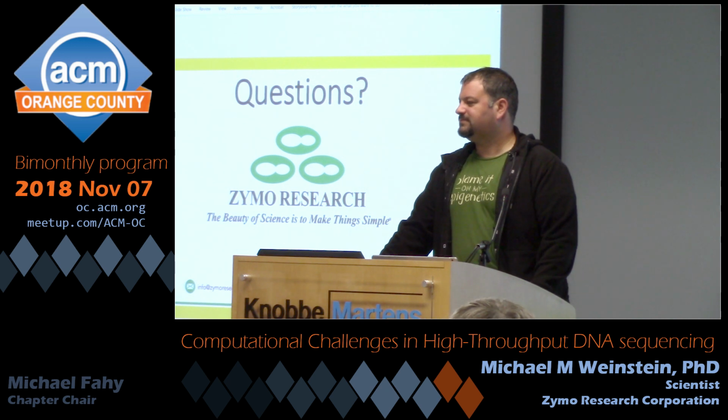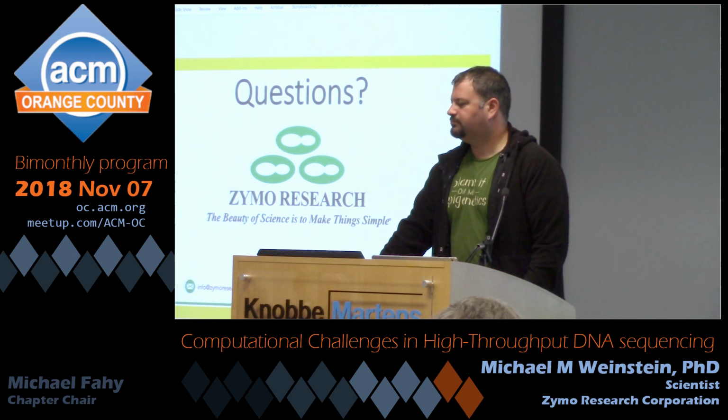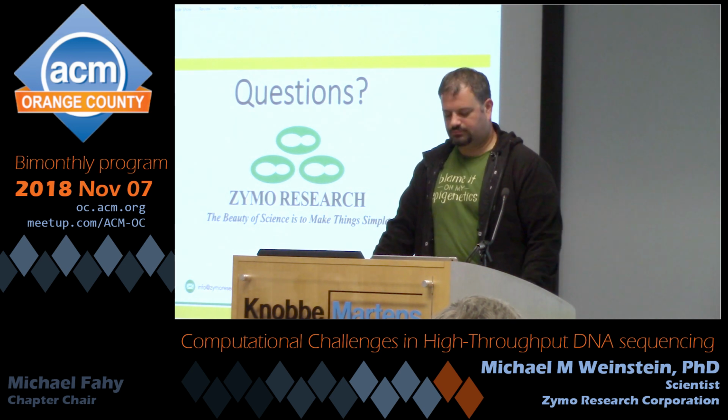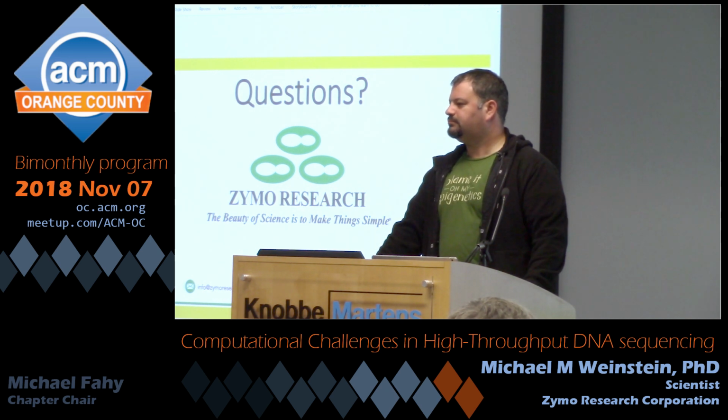You mentioned how many hours it takes to do a particular calculation. My assumption is you're talking about a form of pattern matching, and there's a certain amount of parallelism involved. So when you're using 196 cores or whatever, it takes a significant amount of time, which is obviously going to affect your ability to take the next step. How is it practically being addressed to make those processes faster? Increase the number of cores, look at the parallelism involved.